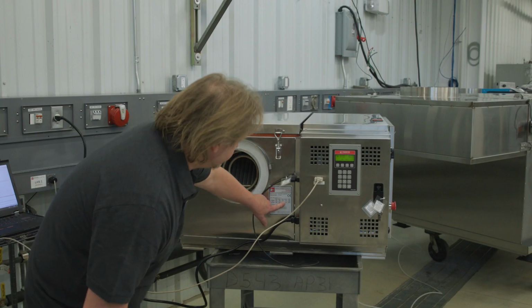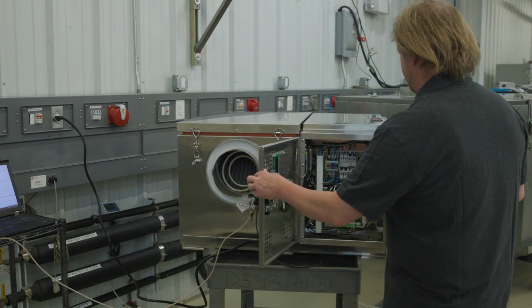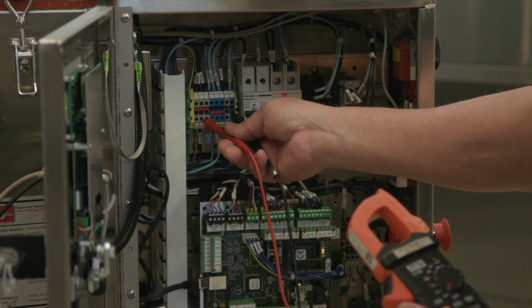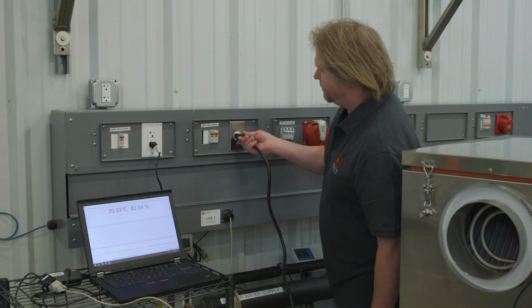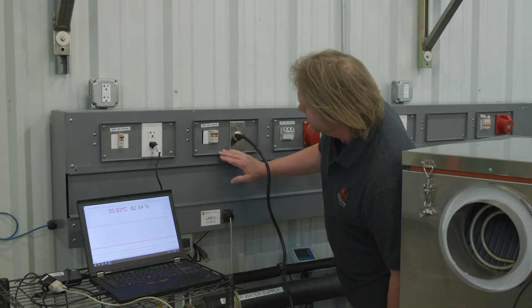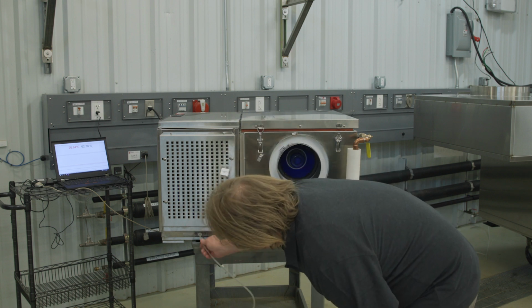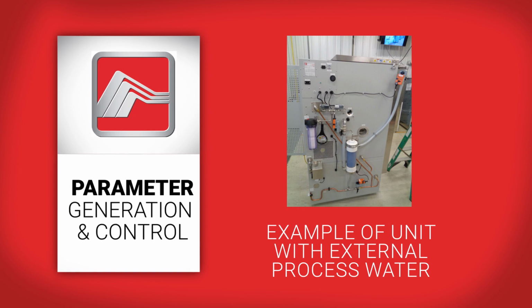Make sure that the electrical power applied matches the data plate. Ensure that a proper external protector is in place. Verify that process water is properly connected. If applicable to your machine, inspect the external process water filters.